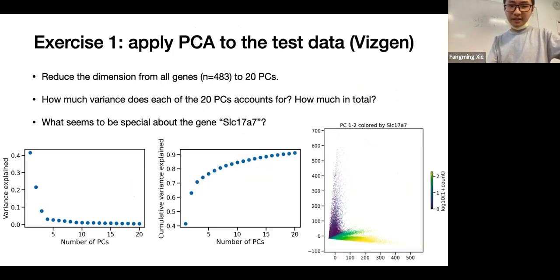And then with the same idea, with the same code, you can apply it not just to X or Y coordinates, reducing to two components, but you can apply it to all of the genes and reduce it, say, to 20 PCs and see their structures. Okay, that's going to be on you, the exercise, and on me, it's going to be the demo.